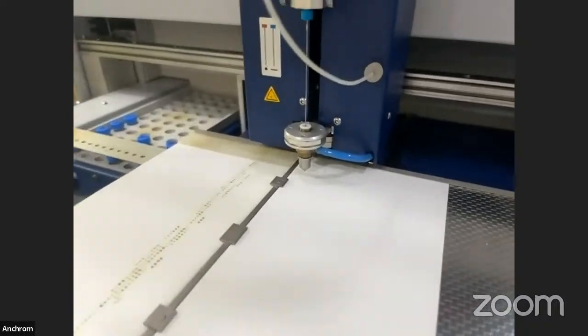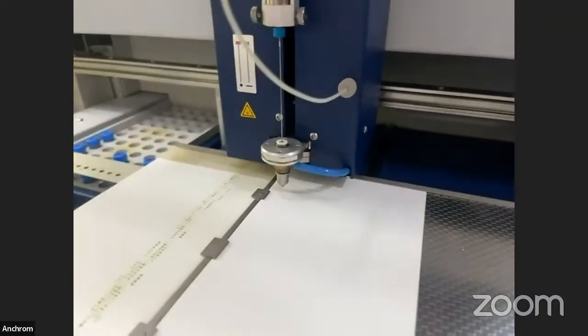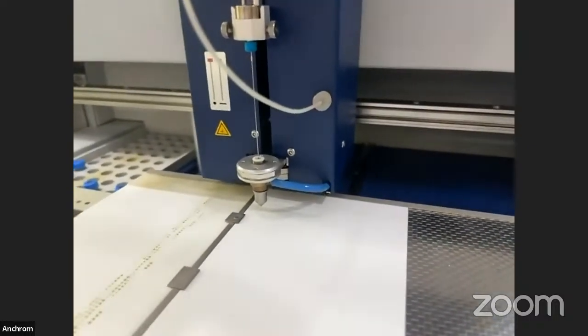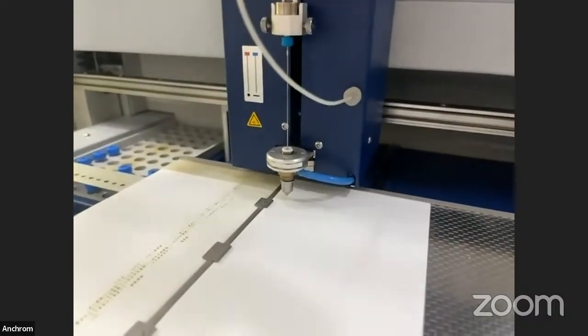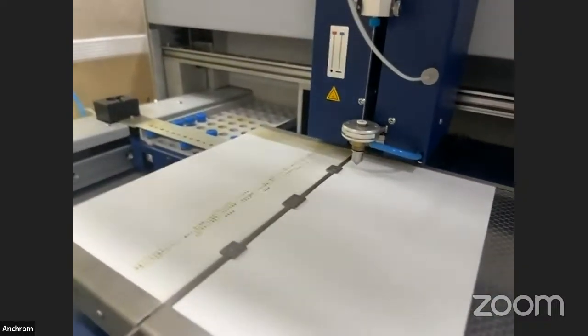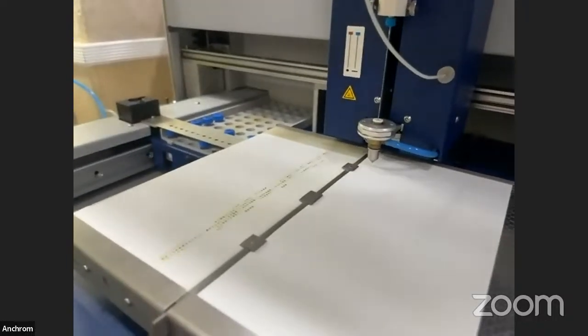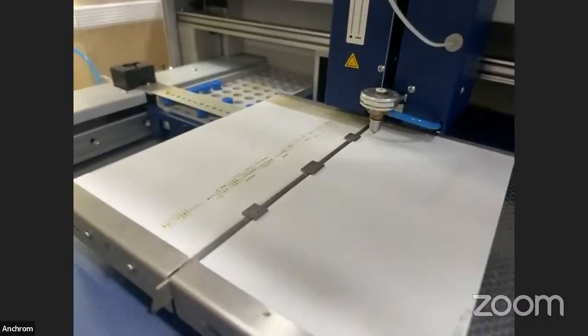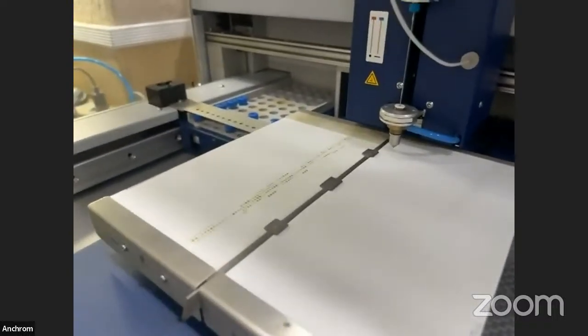So this is how your samples are applied onto the stationary phase. You can see the samples are applied in the form of a band.